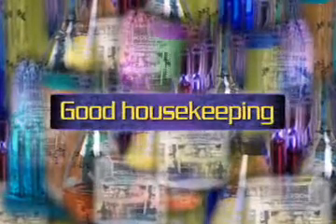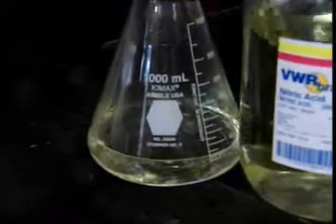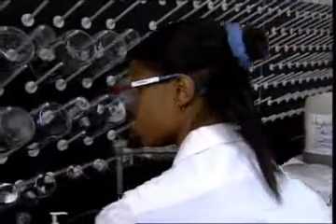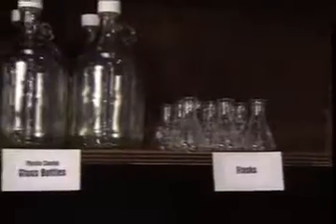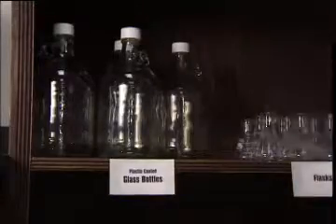Possibly the simplest and most obvious way to minimize waste is by practicing simple good housekeeping. Avoid spilling or dripping any hazardous substances or chemicals. Even spills of some common lab chemicals like methylene chloride can become hazardous wastes. Test tube stands can help avoid spills and breakage. Use unbreakable containers like plastic or plastic-coated bottles whenever possible.